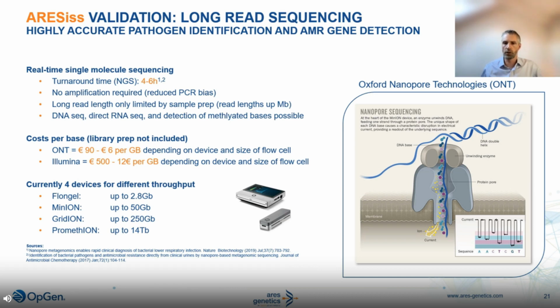Nanopore sequencing works by translocating a single DNA strand across a biological pore and a membrane. A steady flow of ions through that pore creates a current which can be measured and which fluctuates in a DNA sequence-specific pattern as the DNA is translocated through the pore. The downside is that both the nanopore itself as well as the DNA translocating effect rely on live biological proteins, which introduce biological variability into the system, leading to a, in theory, less accurate base calling compared to, for example, Illumina short read sequencing.